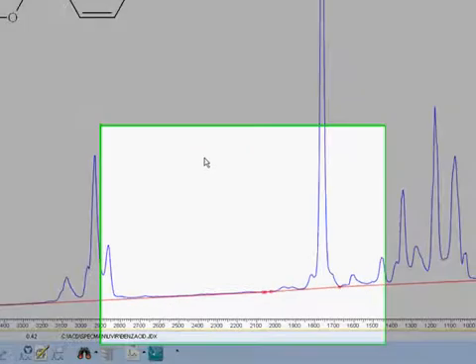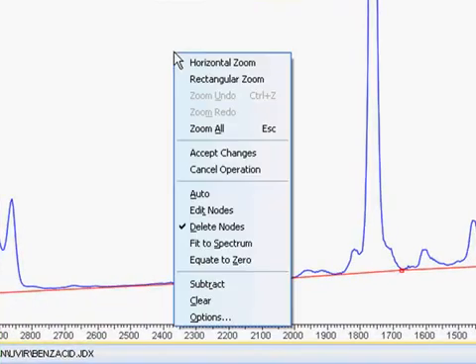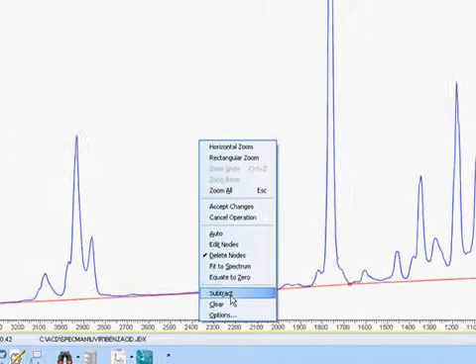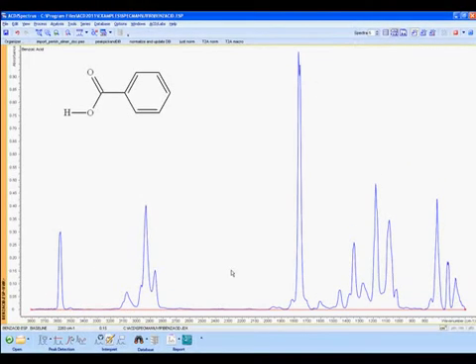Satisfied with our baseline, we'll right-click again to find Subtract in the menu to execute the baseline subtraction. Note that this is still only a display of what the baseline subtracted spectrum will be. We have not yet saved these changes.